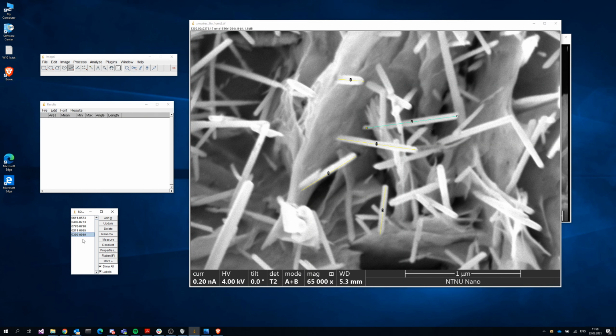Okay, again, measure, and we generate our lengths here. And you want to do that for diameters as well. And from this, you can take, like I said, generate your histograms, and let's see some size distributions. For now, it's just a general tutorial. When we gather more images, hopefully we have enough to generate some meaningful statistics. Let's see if we can see some differences in the experiments. But this is a general procedure.